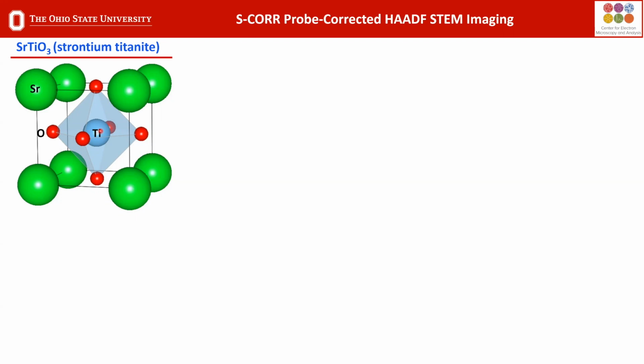And so when we look at this structure with the microscope and we want to see the atomic structure, this is what we would hope we would see. Something of this fashion, a two-dimensional projection of it, right? And so we call it an ABO3 structure, the perovskite structure, because A and B represent the two elements, strontium and titanium, the two heavy elements that are in this compound.